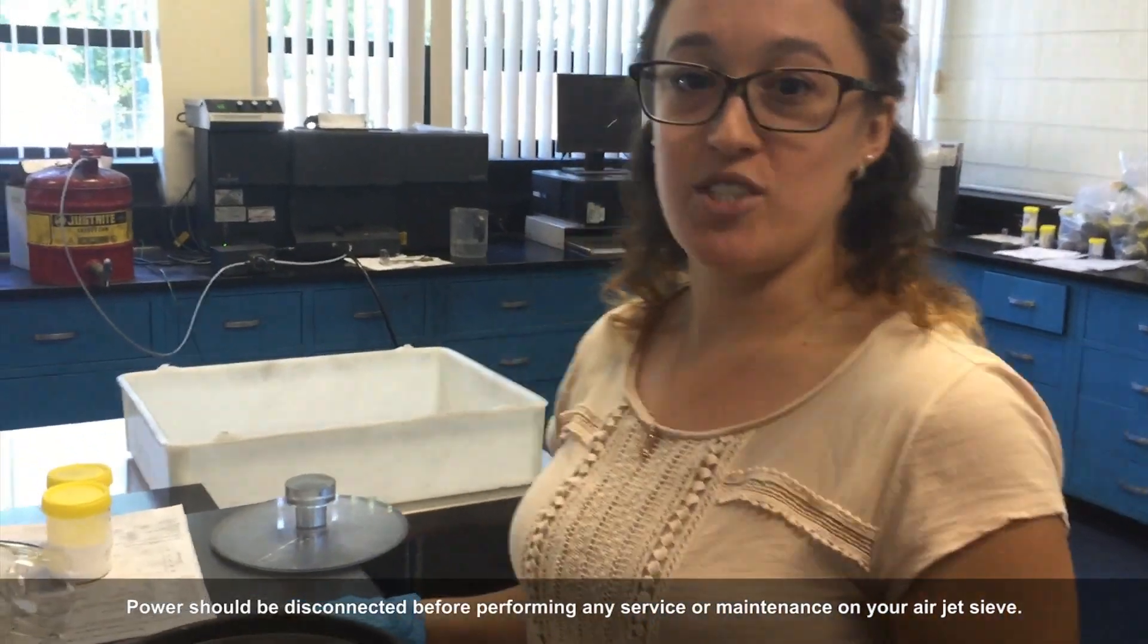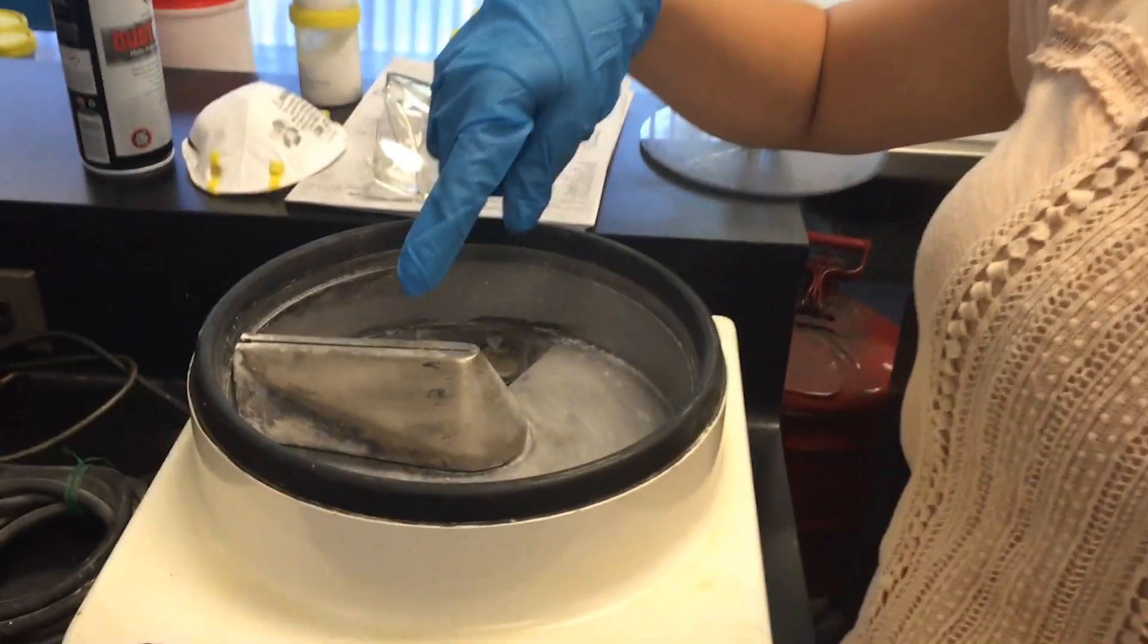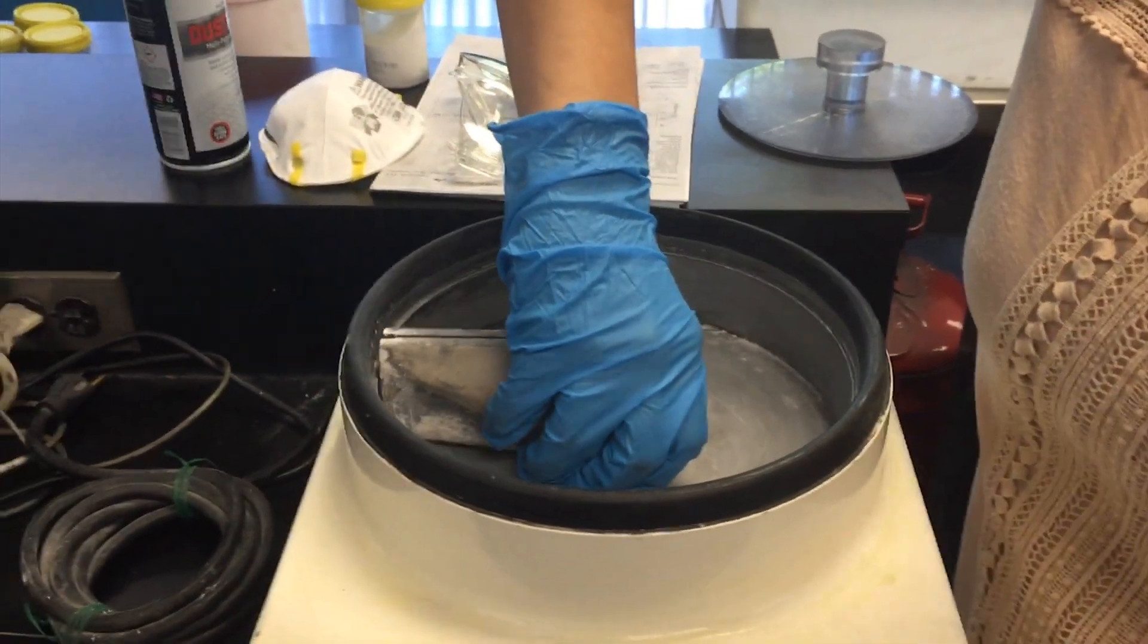First things first, we're going to double check the shear pin. In order to do that, we're going to remove the wand. In order to remove the wand, we're going to pull it straight up.